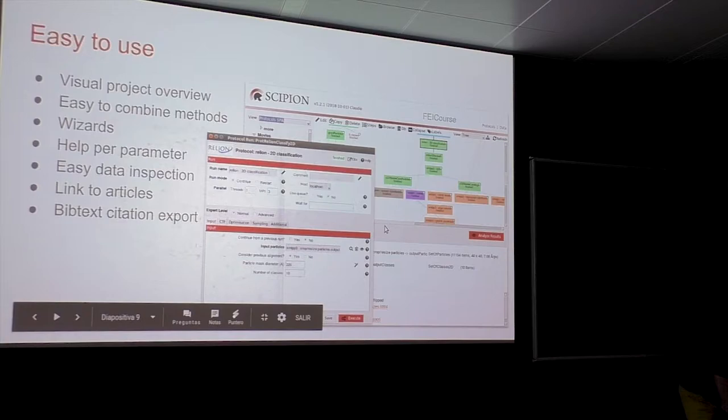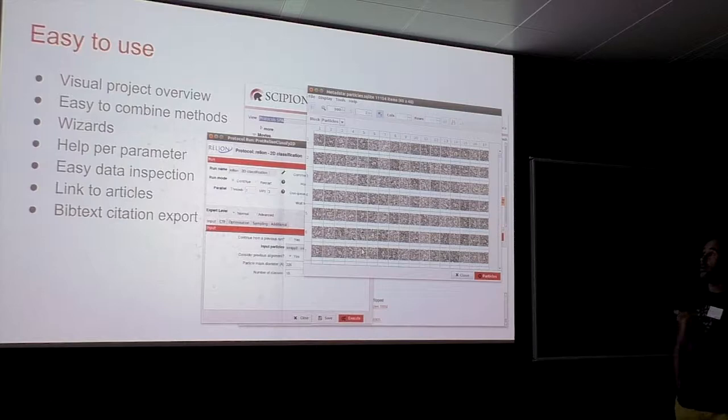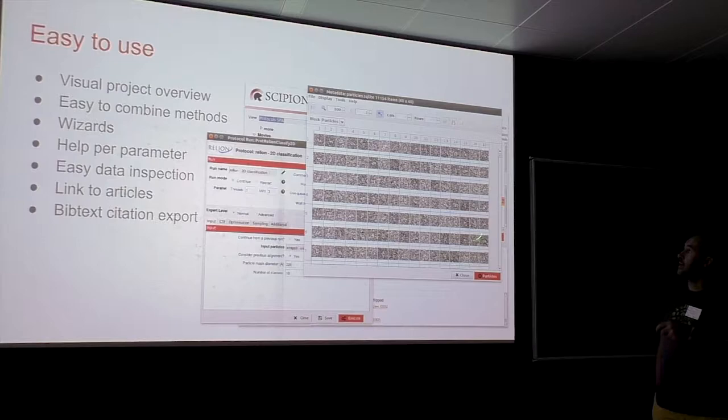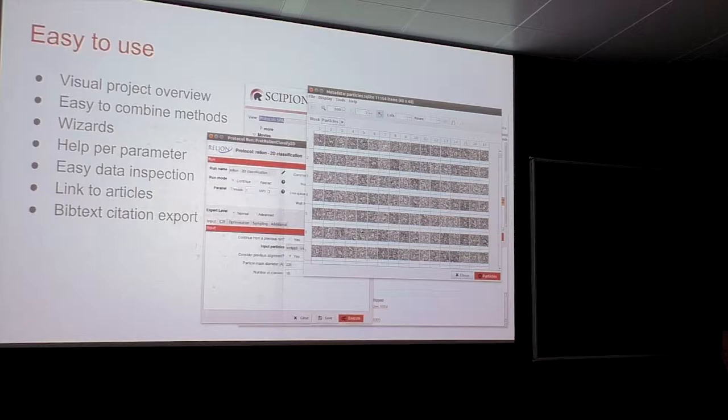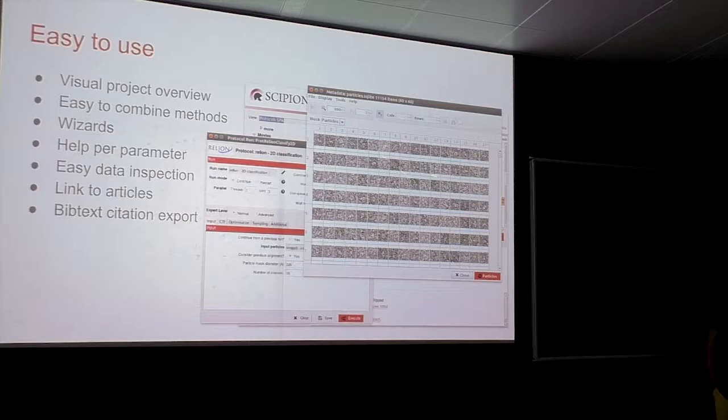You can also view your input sets with a viewer that presents your data in gallery or list mode. You can filter, select, and create a subset of particles. Making a subset and selecting only some of them is as easy as selecting them and clicking — you have a new subset of particles ready to use.